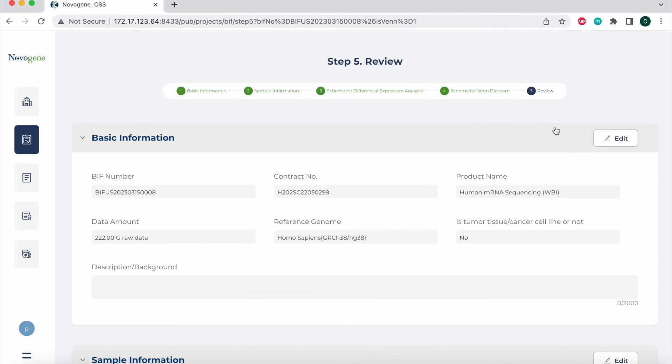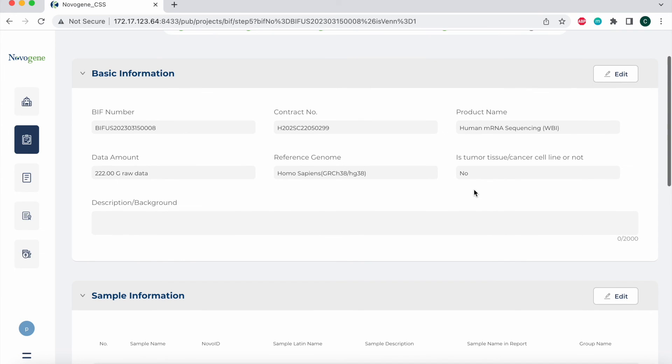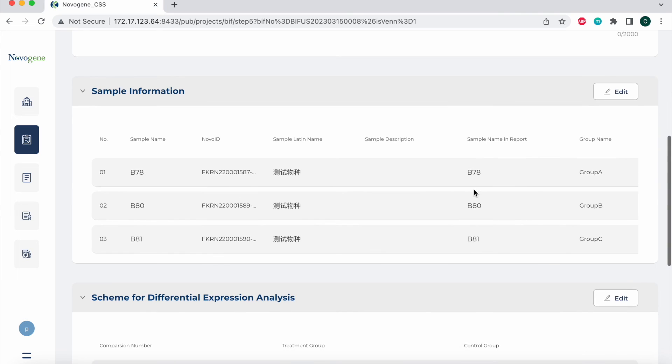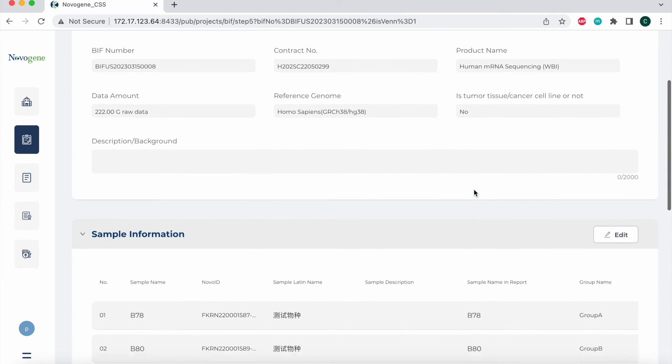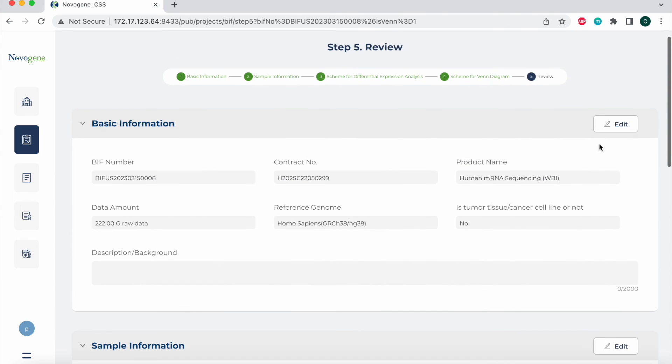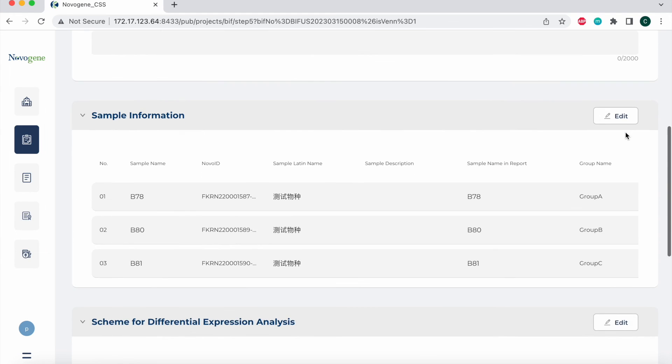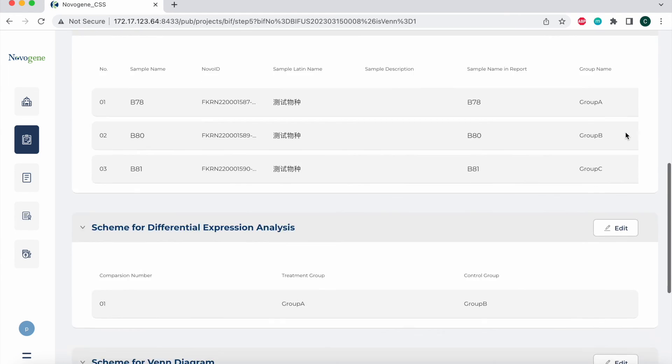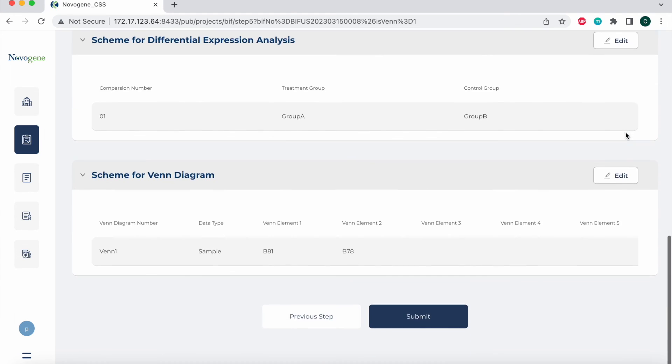On this step five page, you can review the content that you have just created. If you need to review or edit any module based off what you already submitted, you can select the edit button on the top right hand corner of each module. You can submit the online BIF if everything is correct. Then the system will switch to the bioinformatics form page. You will see the order history with the status as submitted.